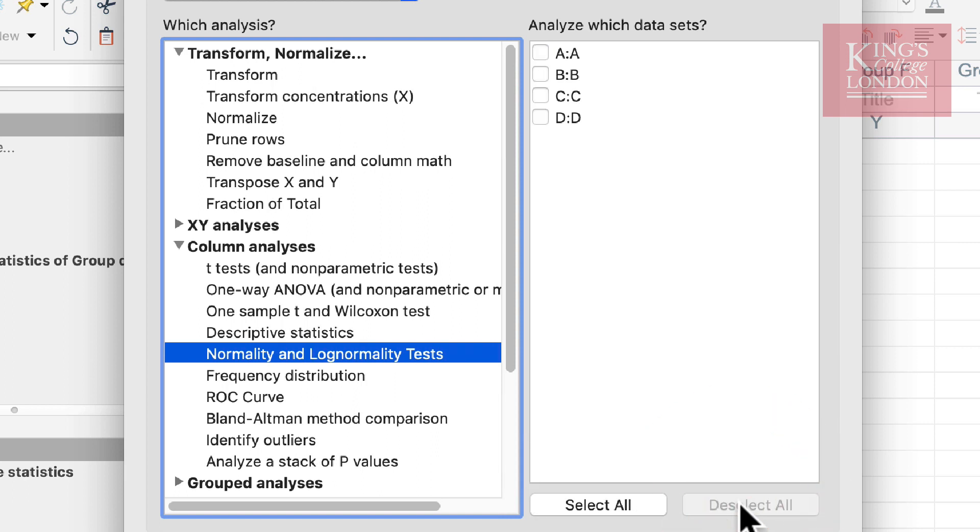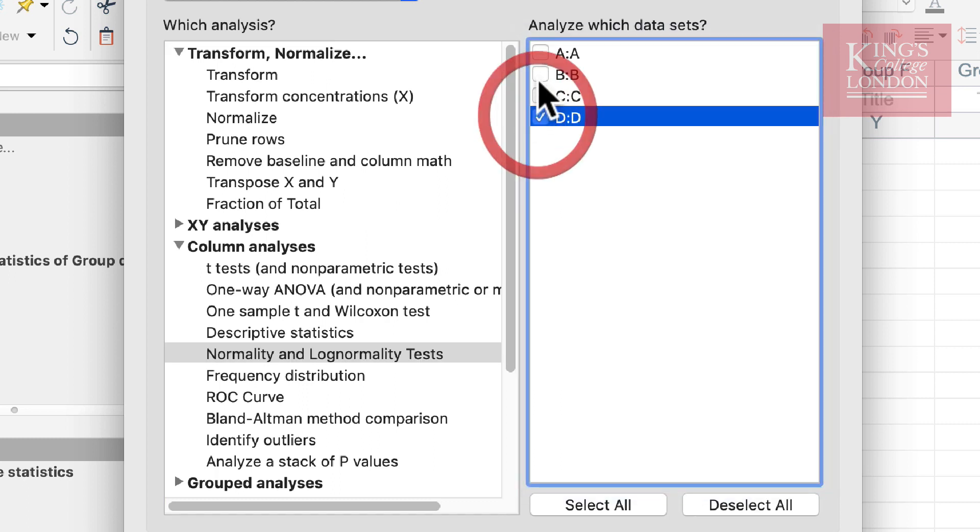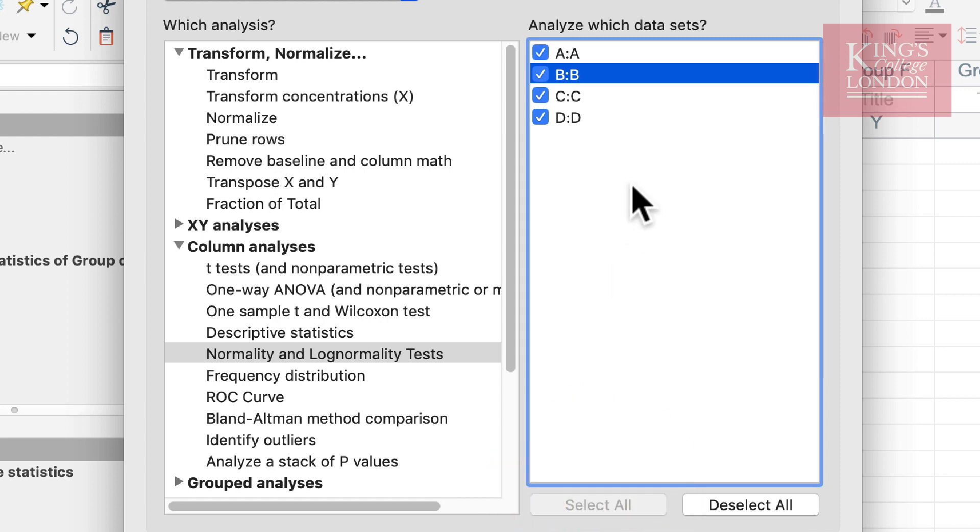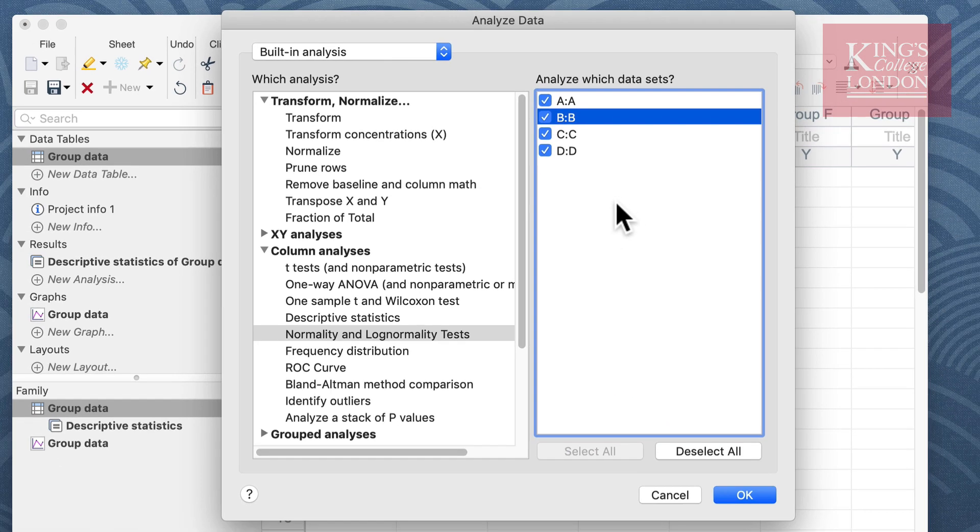...all your data are deselected and then you can choose for instance the data sets you wish to analyze in particular, or you can click on the select all button and all of the data sets on that given table will be selected. Once you've determined which data you wish to compare you then click on OK.